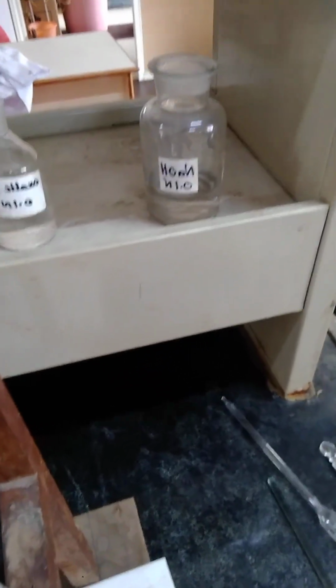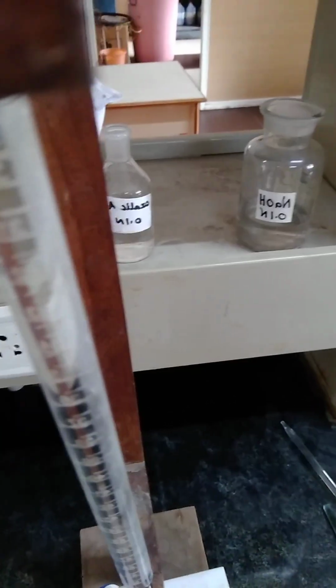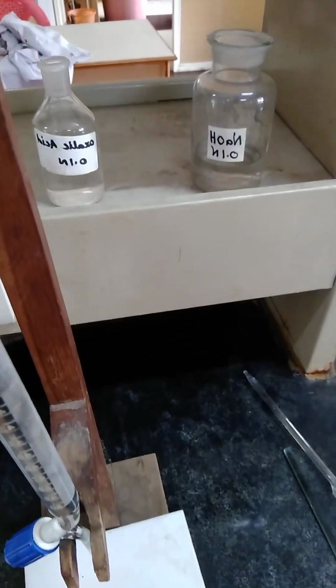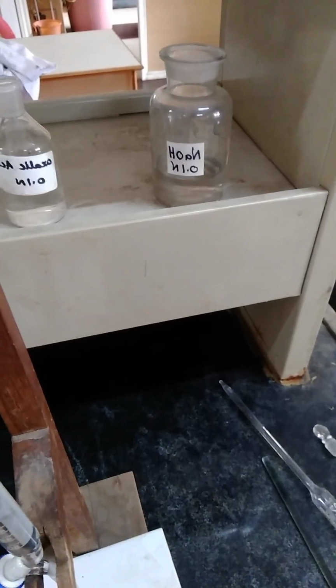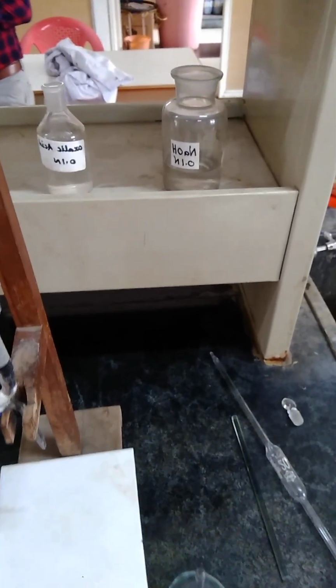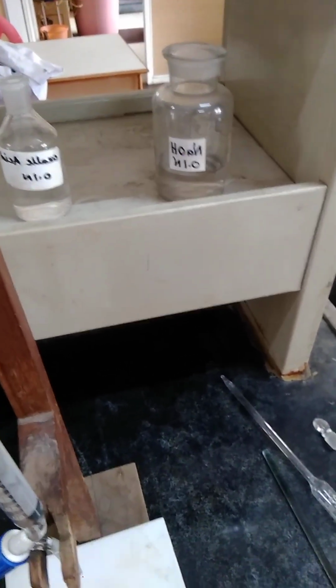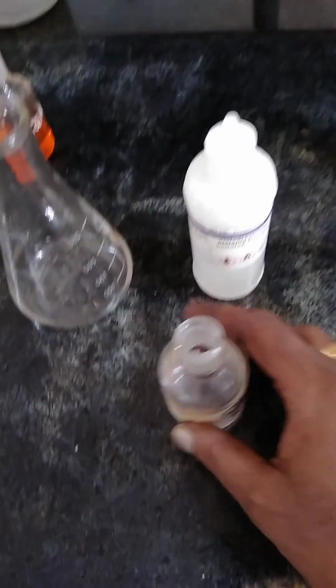For this, we take the NaOH in the burette; that is the standardization of NaOH. We are going to find the normality of the NaOH using the oxalic acid. Then we titrate the HCl with the NaOH.